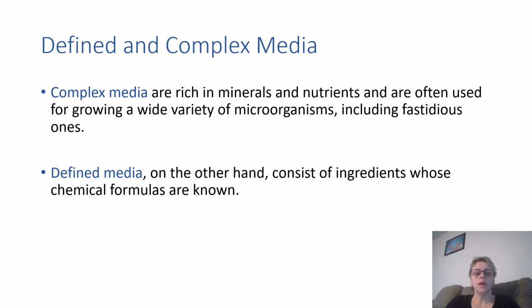Defined and complex media. Complex media are rich in minerals and nutrients and are often used for growing a wide variety of microorganisms, including fastidious ones. Defined media, on the other hand, consist of ingredients whose chemical formulas are known.